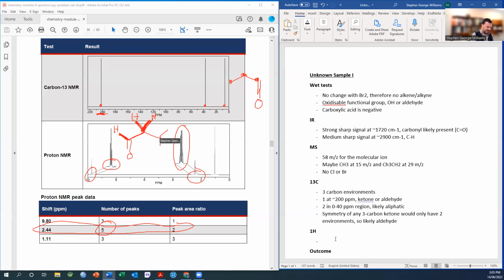Another way to potentially finish this off and to have that same sort of coupling would be to imagine 3 more hydrogens on the other, which would ultimately give me my 4 hydrogen environments from the perspective of these methylene protons. That's one way that I could get 5. Another is if I imagine from the perspective of a certain carbon, I could have had 4 around like that. That is certainly a possibility of how I could end up with a pentet as well. It doesn't match any of the other data that I have, but it's worth noting that that is a possibility.